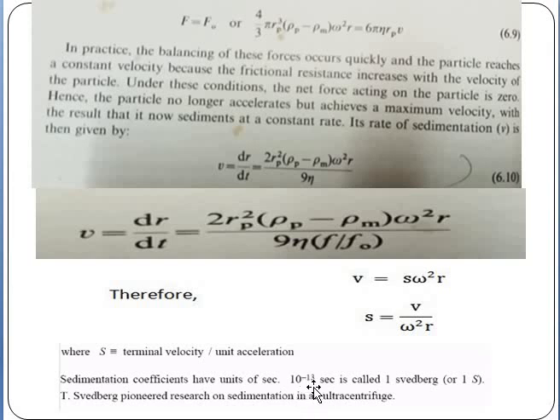This S is generally used in separating molecules, for example while separating cellular components: ribosomes, 60S ribosomes, 40S ribosomes, and the S is related to the Swedberg unit.